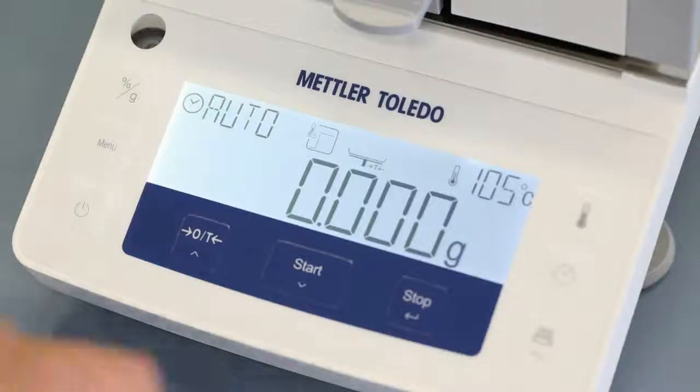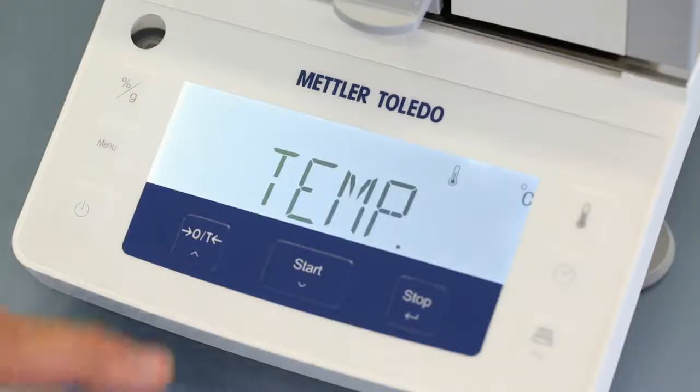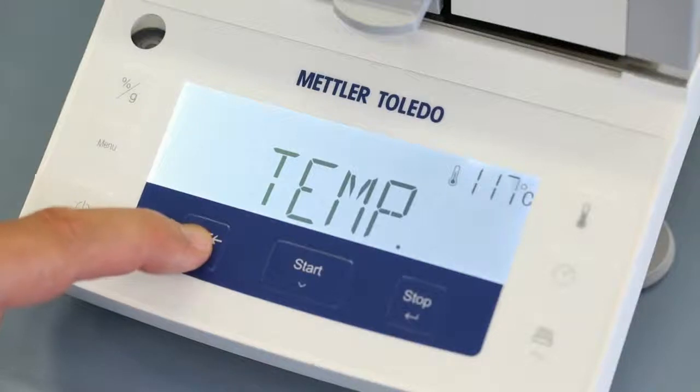If you want to change the drying temperature, press the temperature button and scroll up or down, and finally confirm the chosen drying temperature.